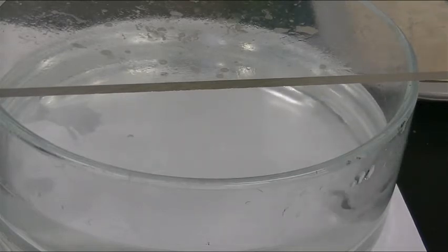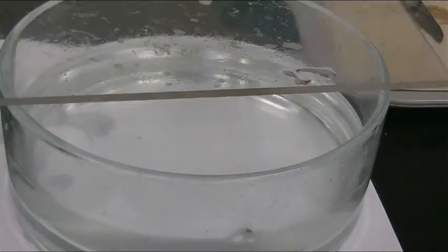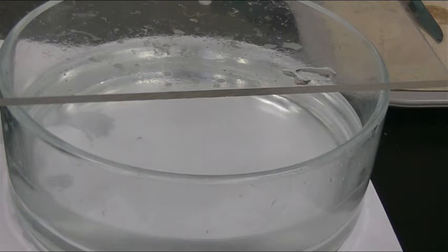So again, it's obviously reacting with the water. This is why we don't use a bigger piece of the lithium, because the lithium reacts. It's a good little reacting guy, but it takes his good old time. Like some of you nerds, getting into class. Am I right? No, that was terrible. That was a passive-aggressive remark that kids relate.